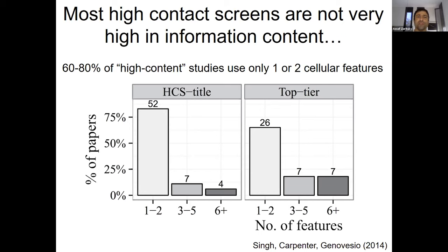And in these years, most of the screening papers actually collected a lot of data, but measured only a few cellular features. Now, that's fine. I have to say that because I just reviewed papers that did exactly the opposite. They should have had a very clear, very specific biological question with known phenotypes, known cell shapes, etc. But they did extract a lot of features to represent what's going on, and then they did the whole circle to go back, and eventually they finished with the simple features that I would start with, because for this problem it was the right way to go.